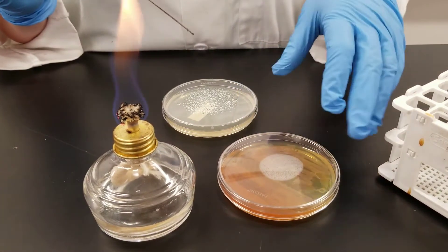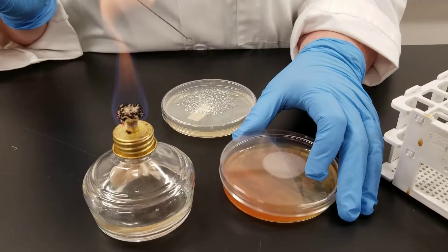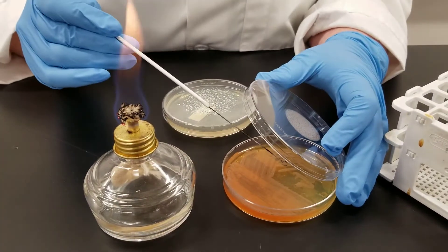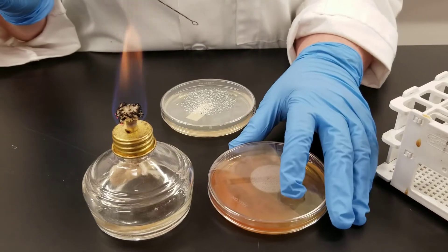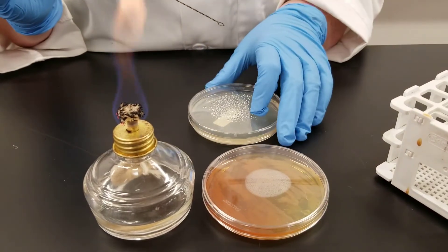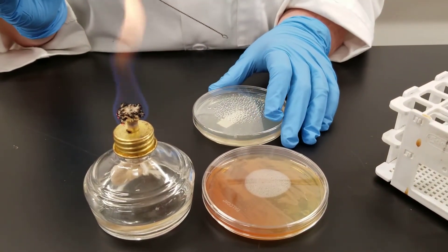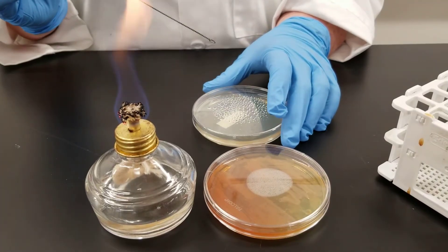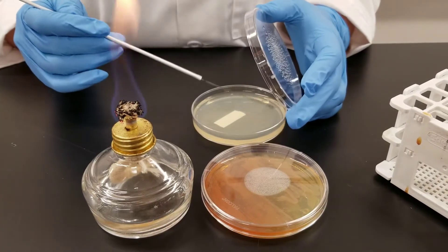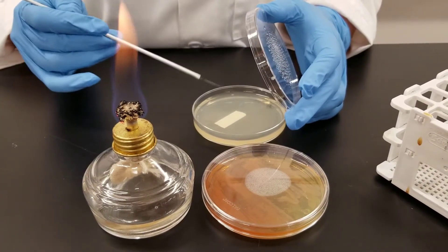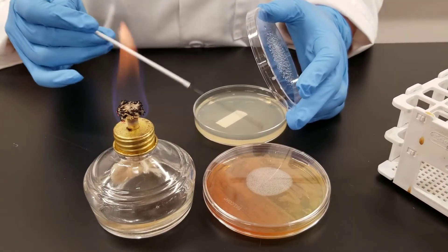Once again, I have flamed this. So now I need to once again go into my stock plate, pick a sample. Now what I'm going to do on this TSA plate, tryptocase soy agar plate, it's like nutrient agar. Most everything will grow on it. I'm going to do a streak isolation. We want to end up with individual colonies. In this first area, I'm going to do a heavy streak back and forth.